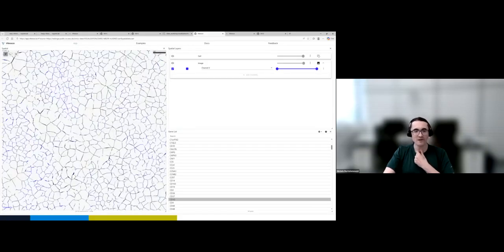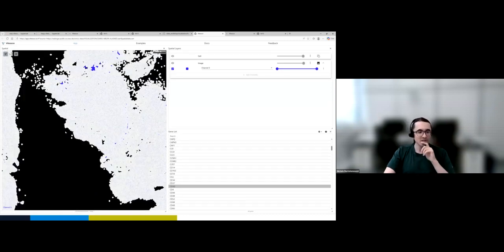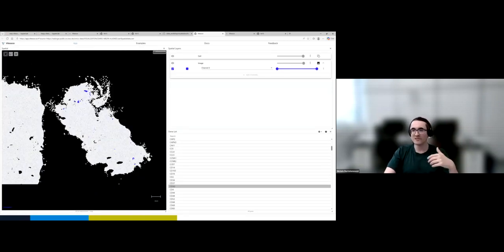This is now not showing. This is not yet working with the automatic configuration. So this is still not perfect, but it becomes quite easy to use and to set up for a starting point. So you don't really need to write your full configurations and structs. You can set this up already this way and use this as a good starting point.